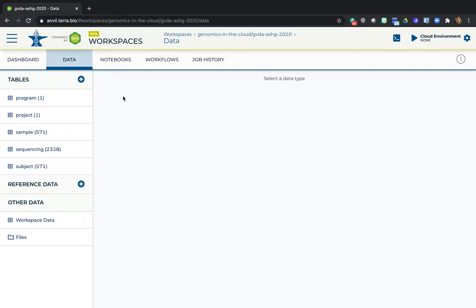We're picking up where we left off in the data section of the workspace you created for the imported datasets. Hopefully, you recall seeing these various data tables.